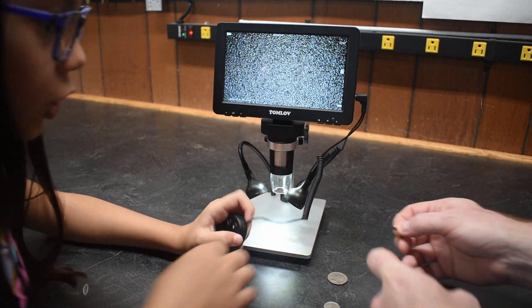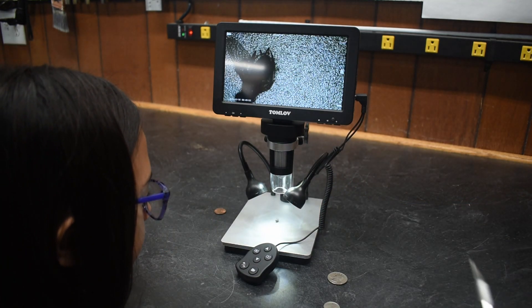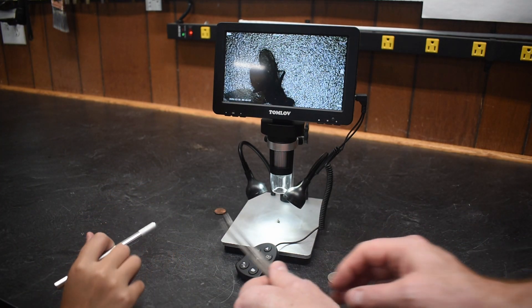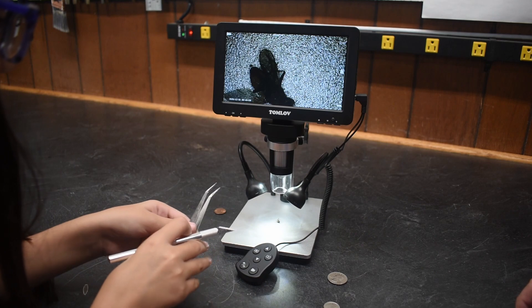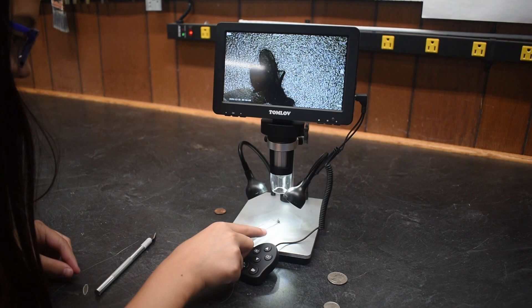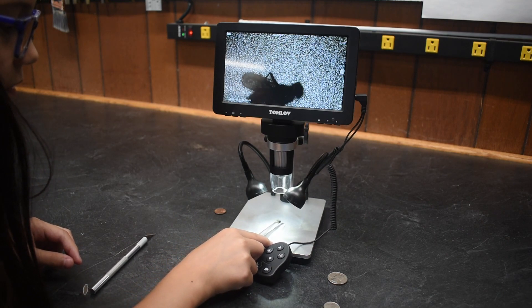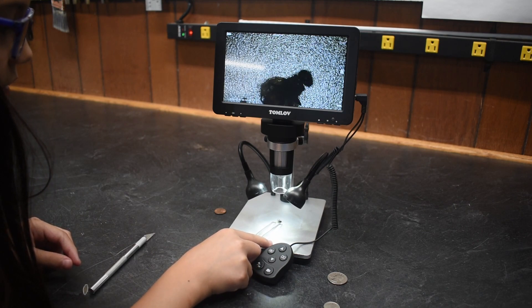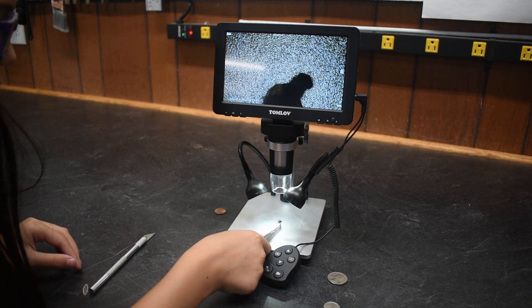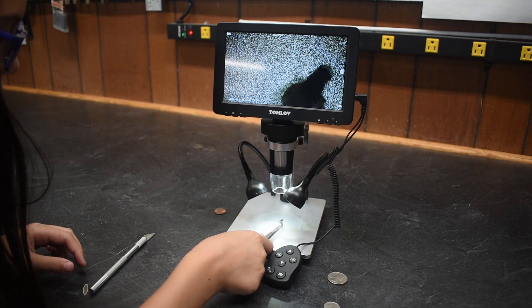Here's a dead fly. So here are some tools — you can use this to kind of move it around, and then here are some tweezers. You don't like the dead fly? Let's see if we can get in on this wing or something. Dave, do you want me to pull it off? No, leave him in one piece. Let's just move it and then try to zoom in on a wing.